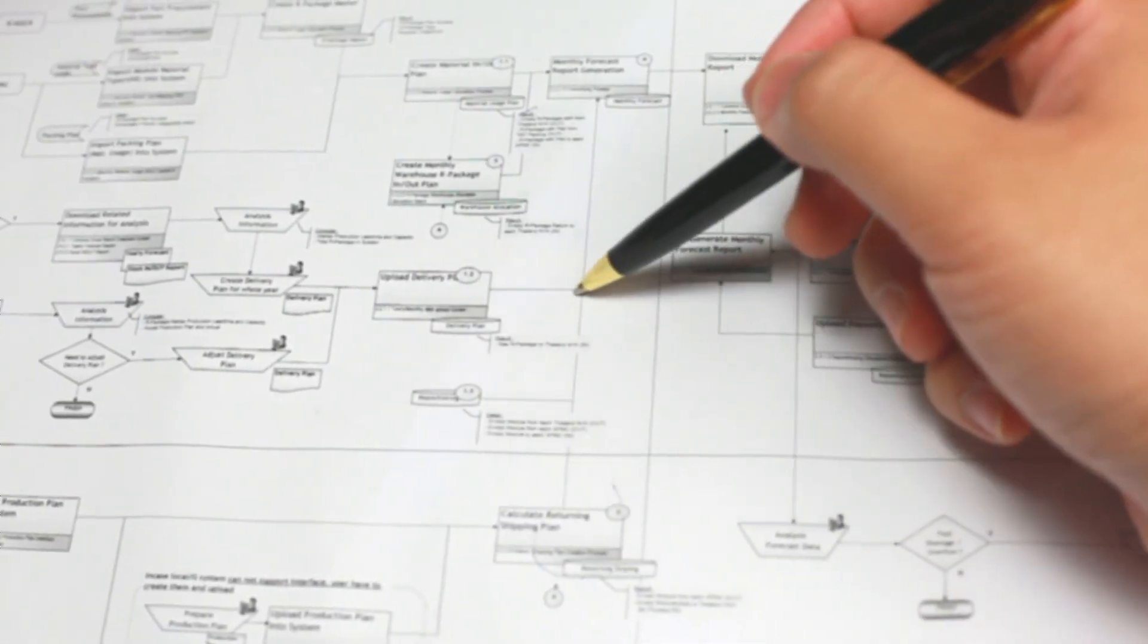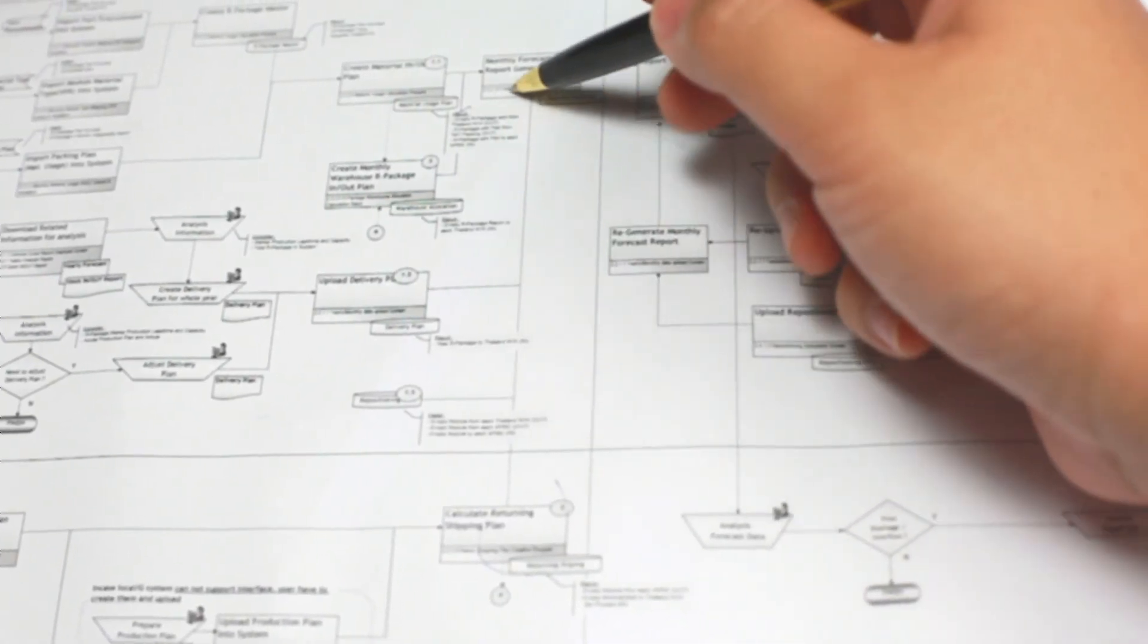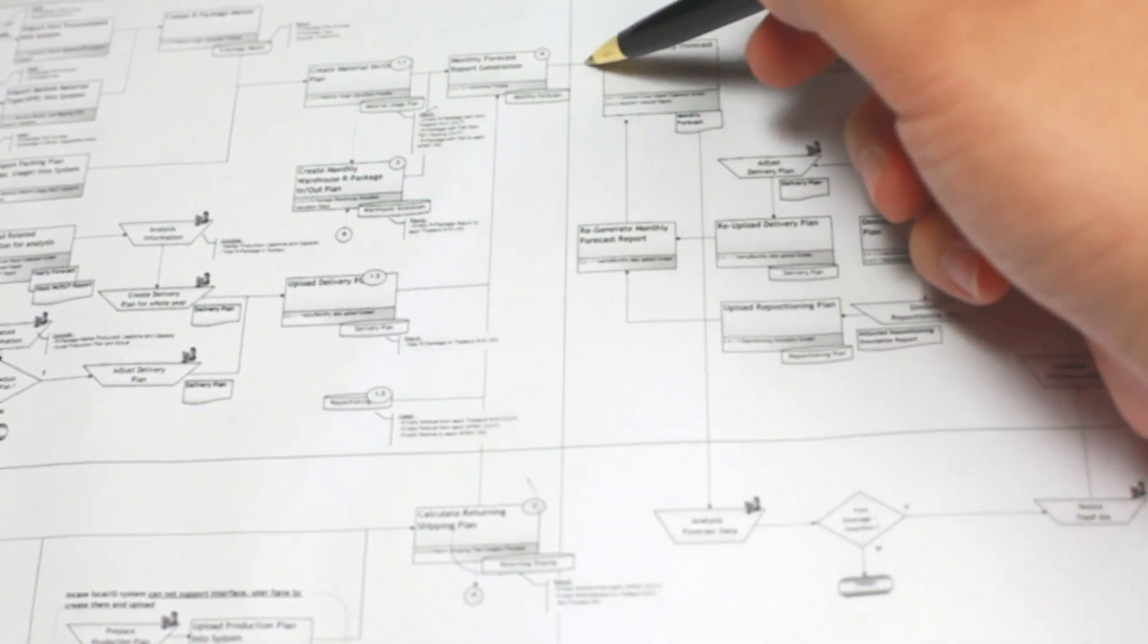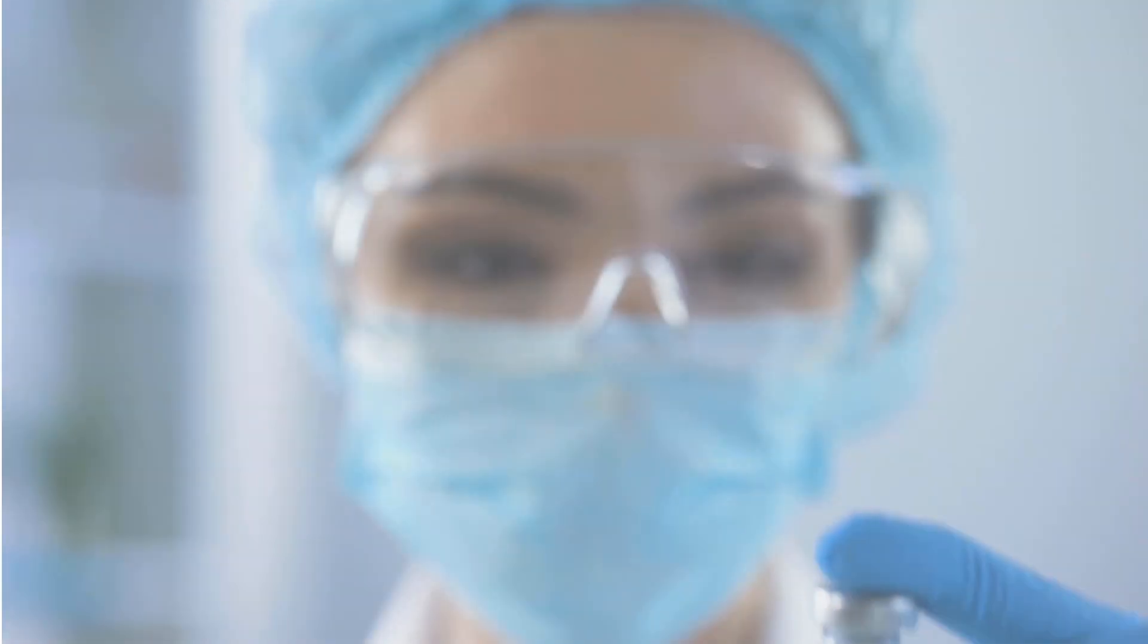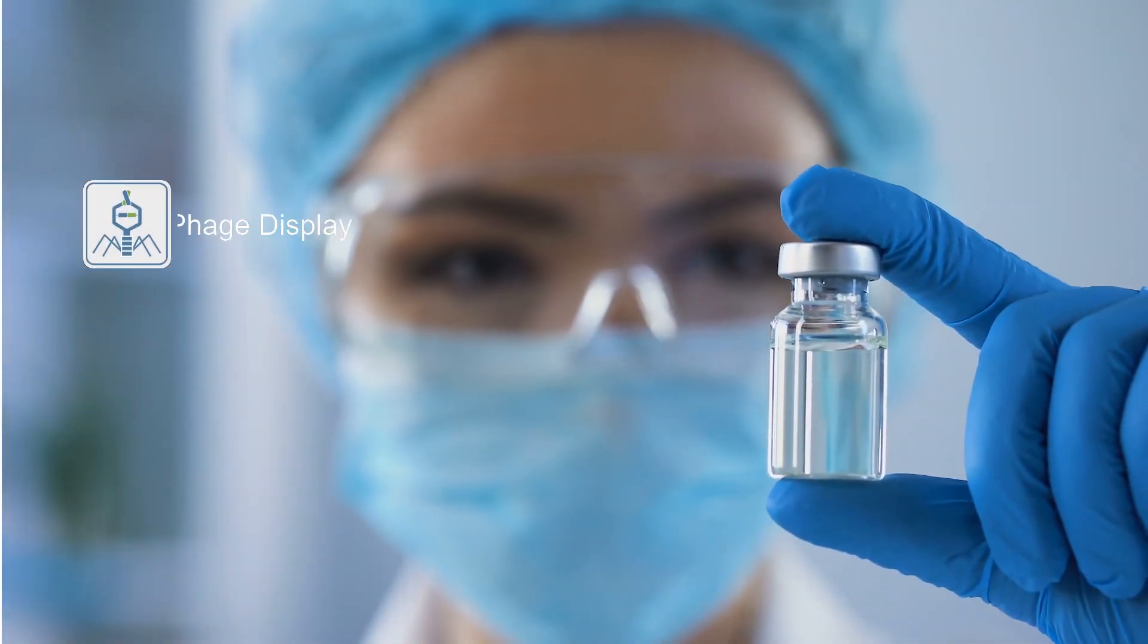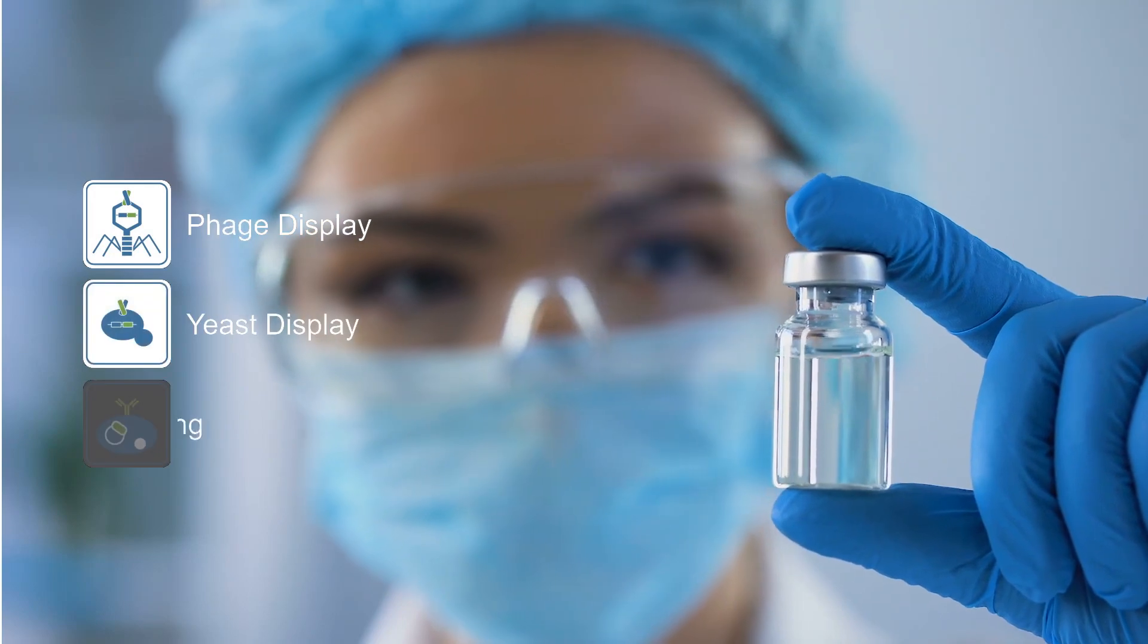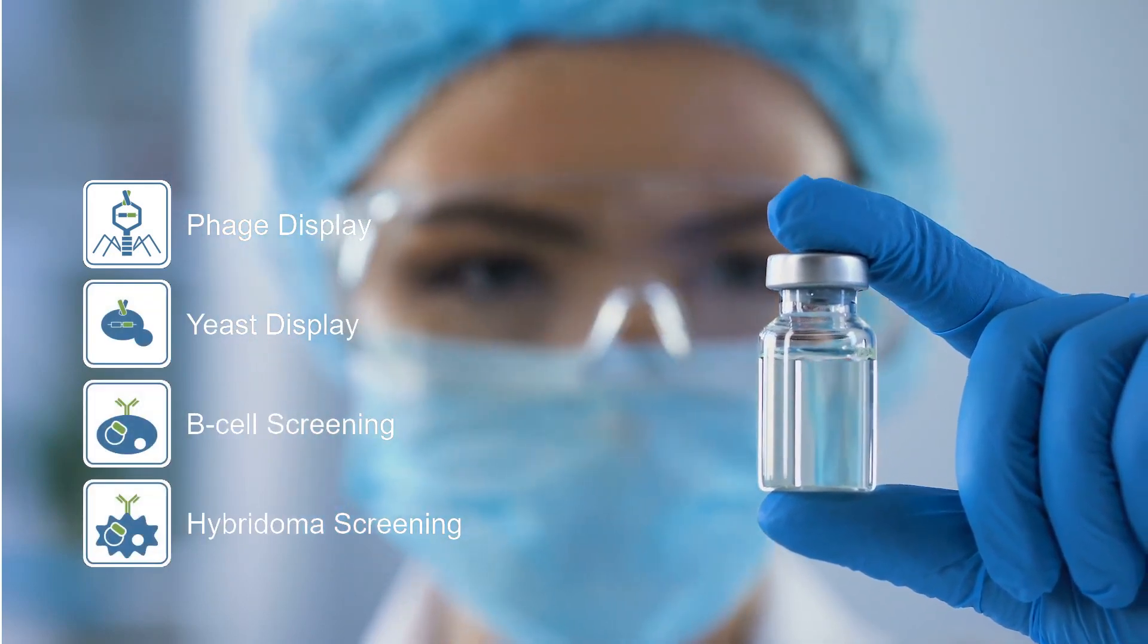The underlying discovery processes are iterative, multi-step, and based on an array of complex discovery technologies such as phage and yeast display, B-cell screening, or hybridoma.